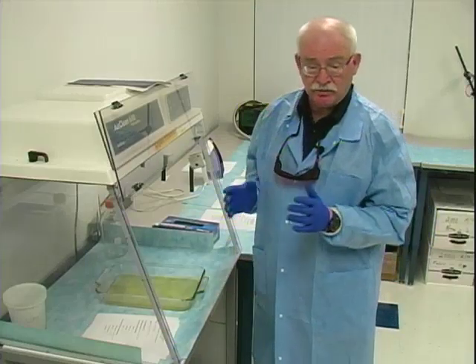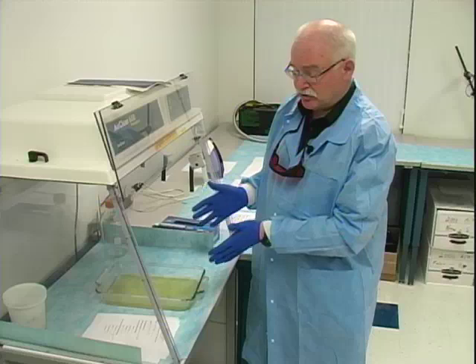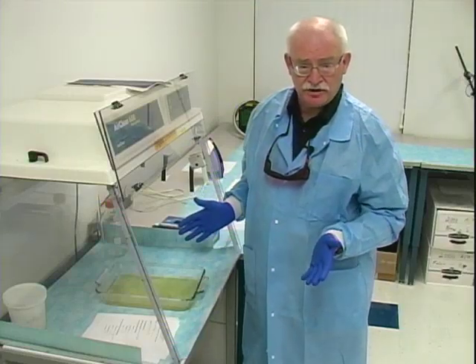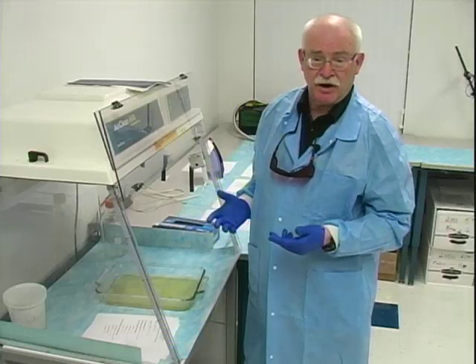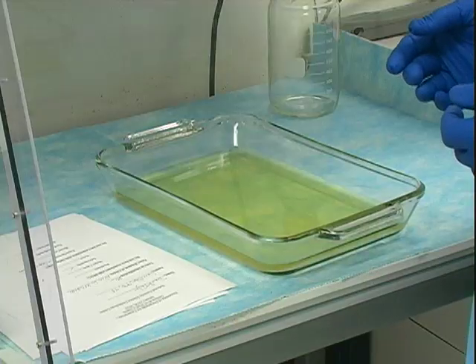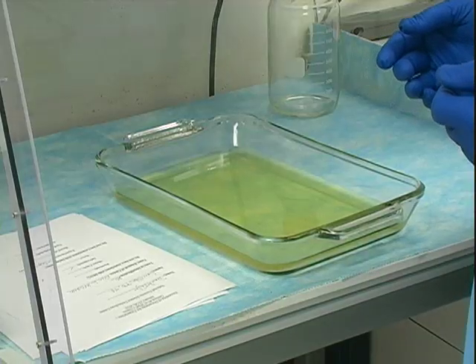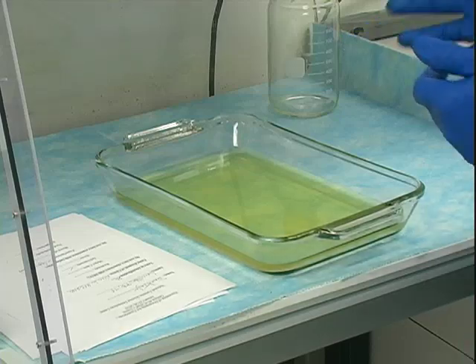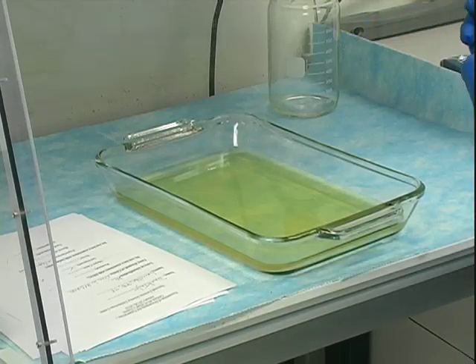It must be said that this first stage could be substituted with the DFO solution, but it is my preference to use indanedione based on its past performance. I think it is a more sensitive reagent, and therefore that's the one we're featuring in this workshop.